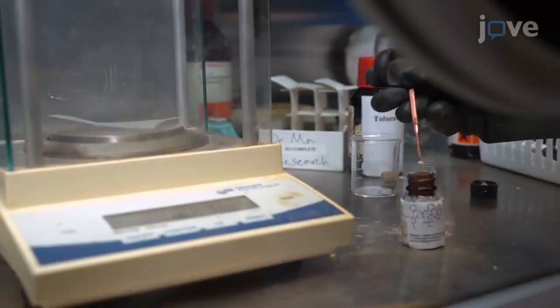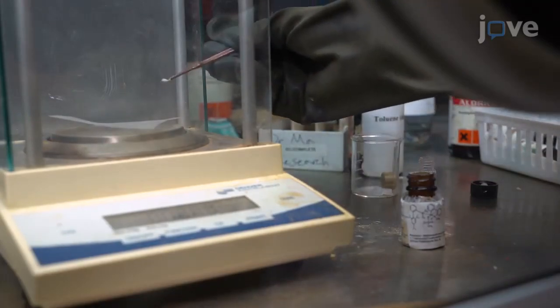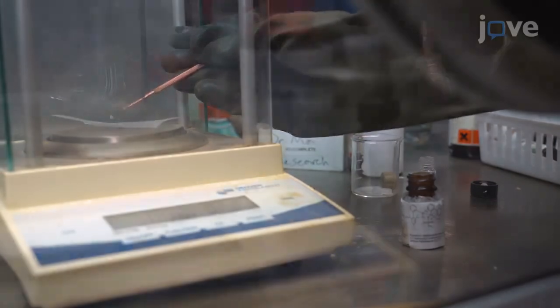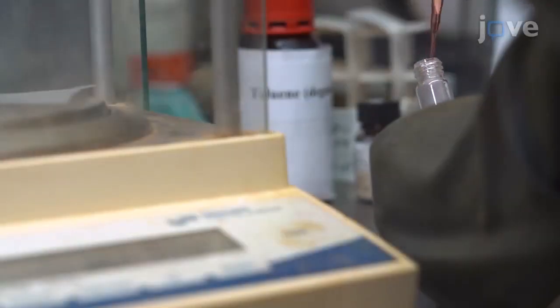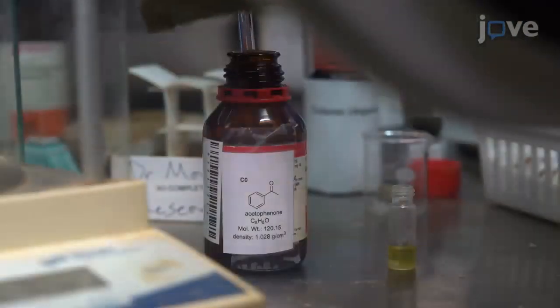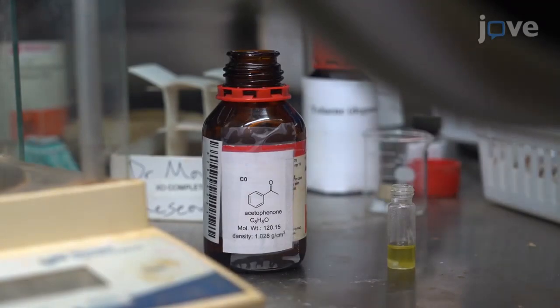Weigh 9 milligrams of XPhos palladacycle generation 4 catalyst and add it into the microwave vial. Dip the spatula into the solution in the vial and swirl to ensure the complete transfer of the catalyst. Then, use a suitable microliter syringe to add 64.4 microliters of acetophenone into the microwave vial.